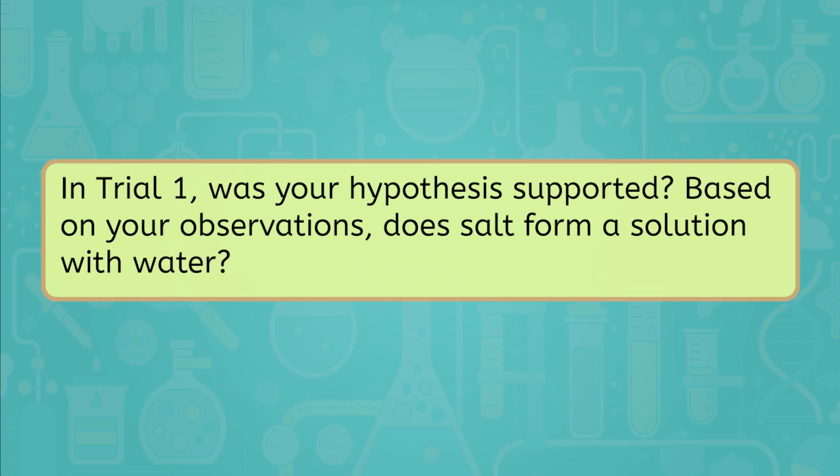Let's start with trial 1, salt. Was your hypothesis supported? Based on your observations, does salt form a solution with water? Pause the video and record your thoughts in your interactive lab notes.